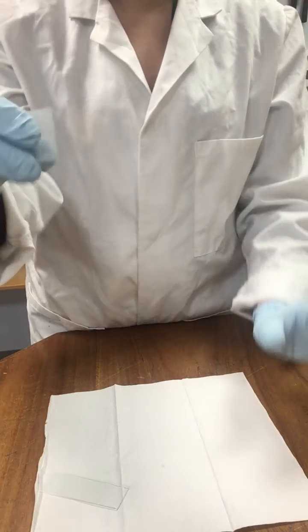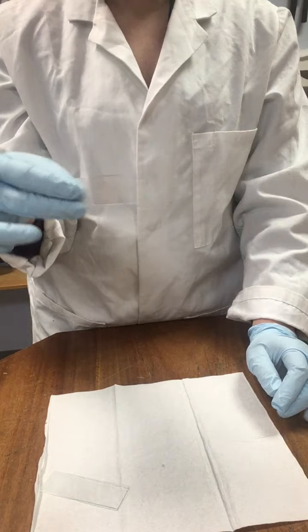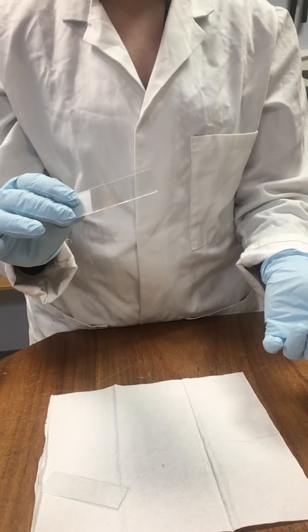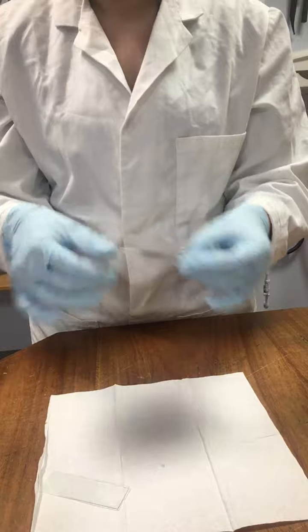Now that unfortunately is not a particularly good blood smear. We have got quite clear striations in there, so what you're looking for is a nice gentle action, but you can practice again and again, and then basically you take the slide that is most suitable for you.